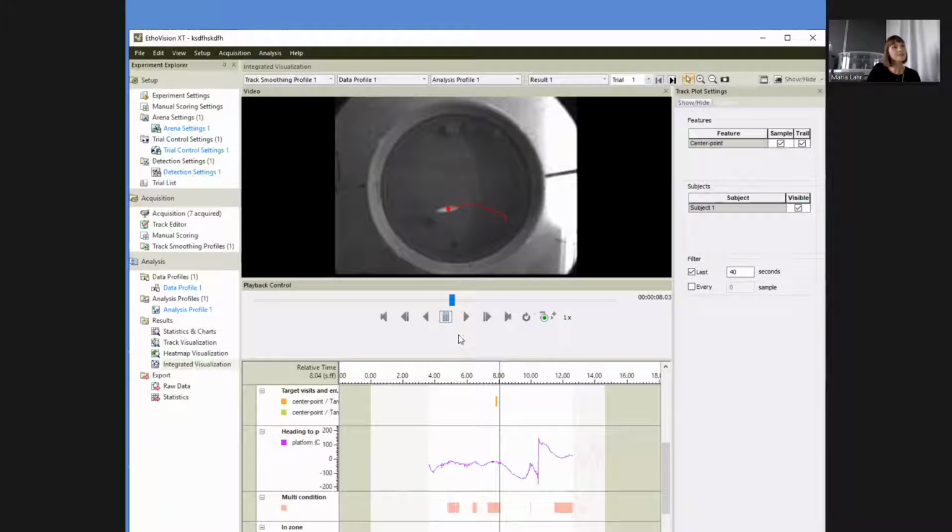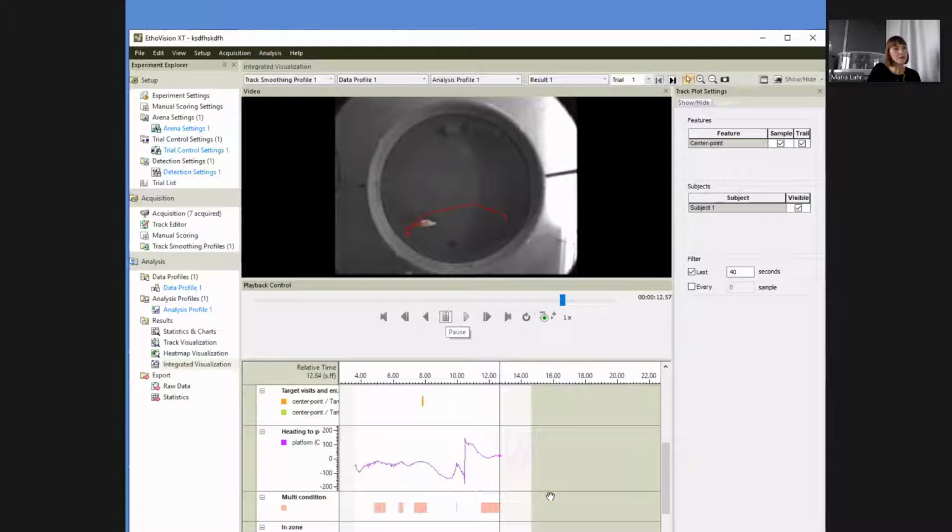And then it passes, and then it goes into this weird angle. And in the end, you see how much sense it makes to eliminate when it's on the platform, because now it reaches the platform and it continues to show in your analysis. So here I have removed the last 2 seconds because, for example, for the heading angle, I would get a huge mess of data. So it's very important to eliminate this.